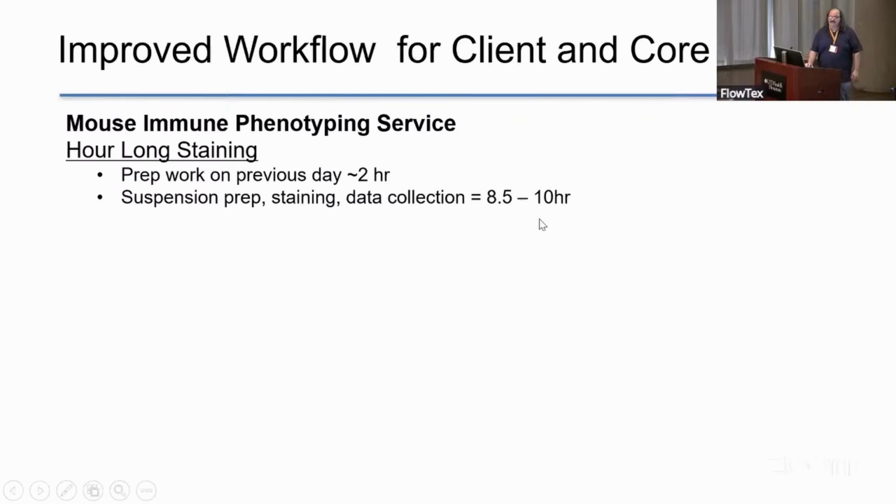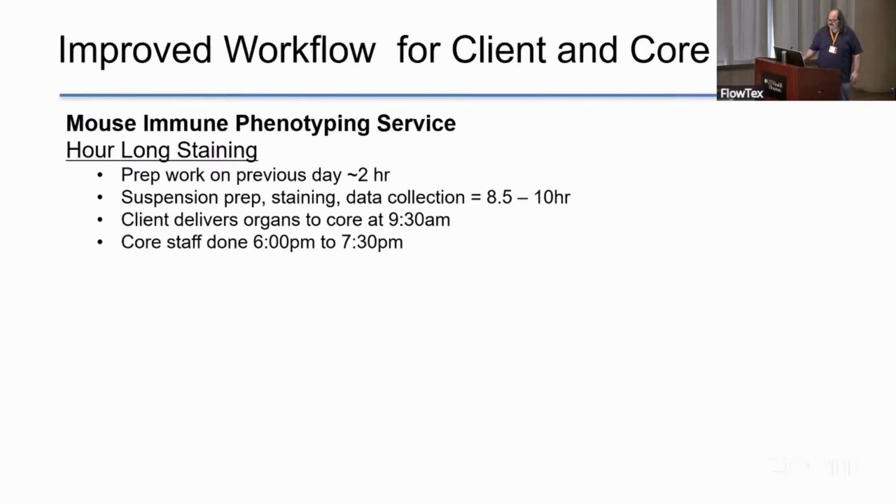And so needless to say, I'm exhausted, but it's not just bad for me, because I'm getting home around 7:30 at best. But my clients have to bring their actual tissues to me at 9:30 for me to get home at 7:30. That's just not nice to do to them, because one of the people we worked with before we had this overnight thing was doing myocardial infarctions in mice. And so they had to have the surgeons in there tying these things off. So they would be here like 5 a.m. in the morning just to bring me the samples so I could actually do their analysis for them.